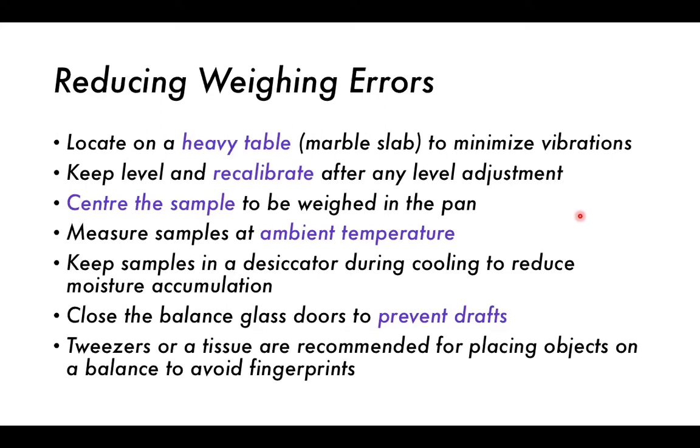This can be due to atmospheric effects, amongst others, especially if you live near a train station, or the lab is near a train station. Then the vibrations from the train going by can also cause errors in the weighing.